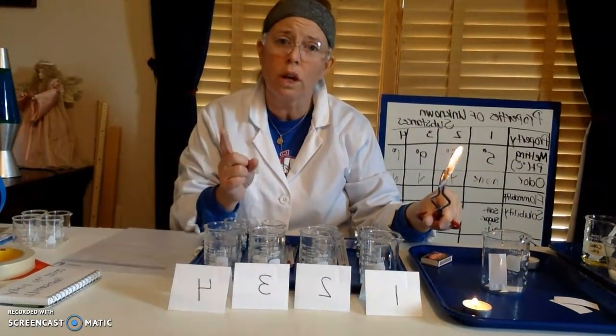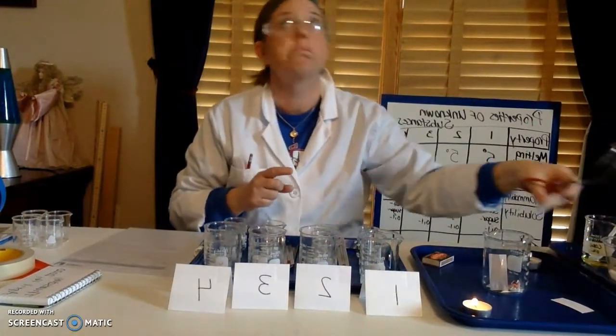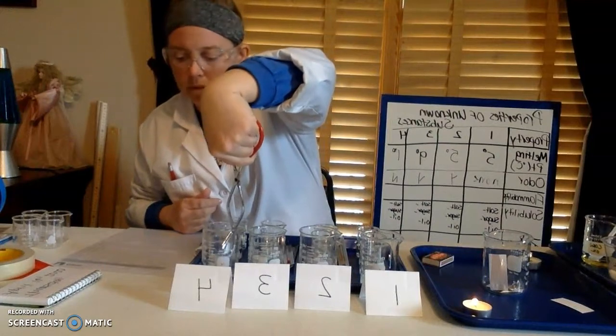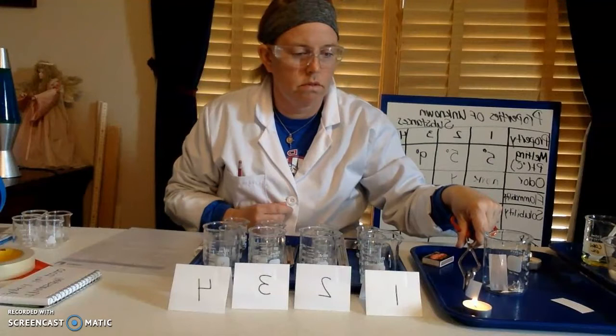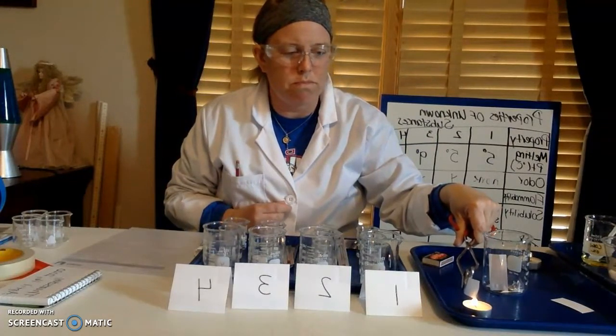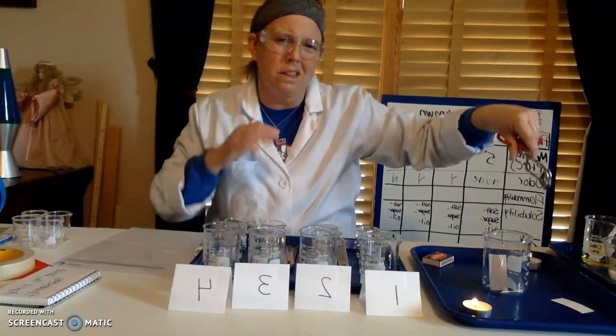Woo! Hopefully I don't set off my fire alarm in my house. I'm good. And number 4. You can't really clearly see, but it's trying. It kind of snuffs itself out. So we'll give that one a maybe.